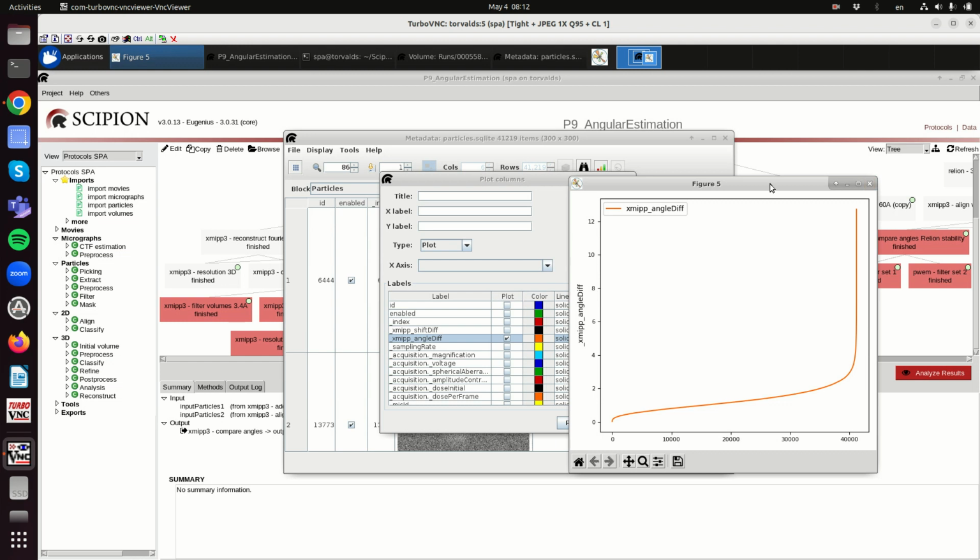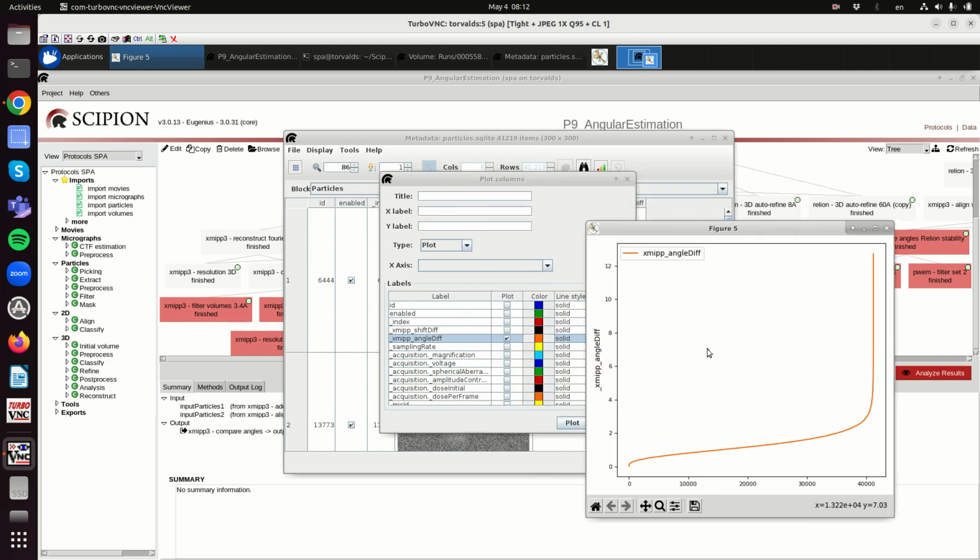Even if you have a very good setup with no particles around, no CTF, just noise, and it is not a terrible noise, even in this case there will be a fraction of particles for which you will make big mistakes, and for the other particles the angular assignment will not be perfect. It is good enough to have a good reconstruction. So we have two kinds of errors: small ones, sufficiently close to zero, and the average is not zero, so this is a mistake.